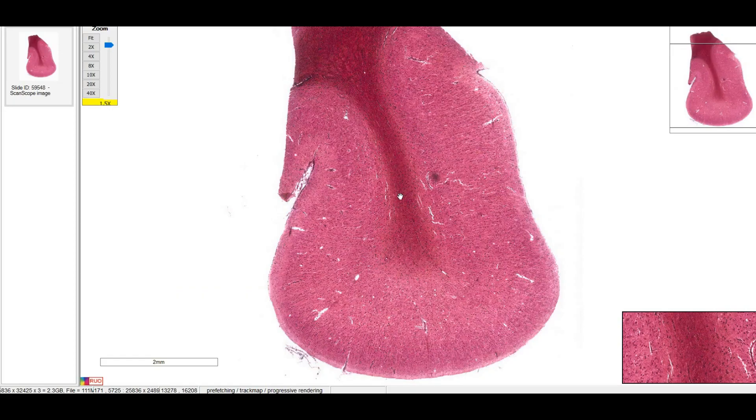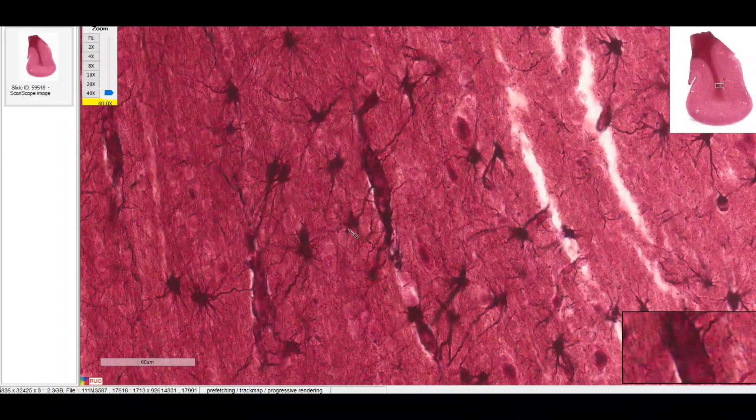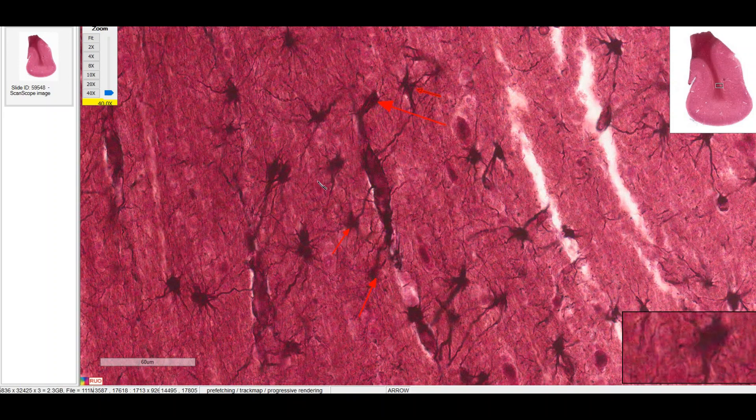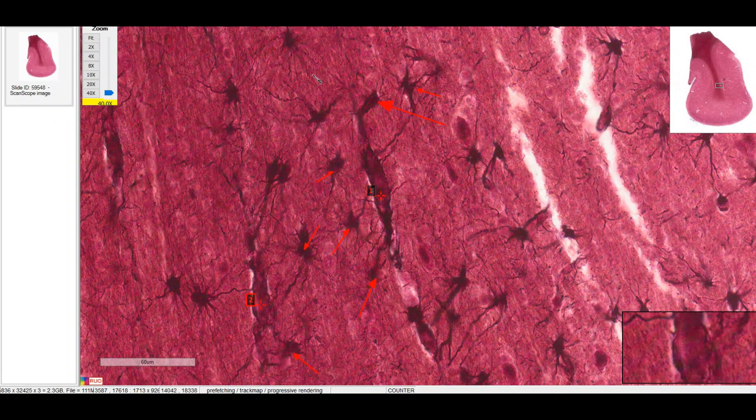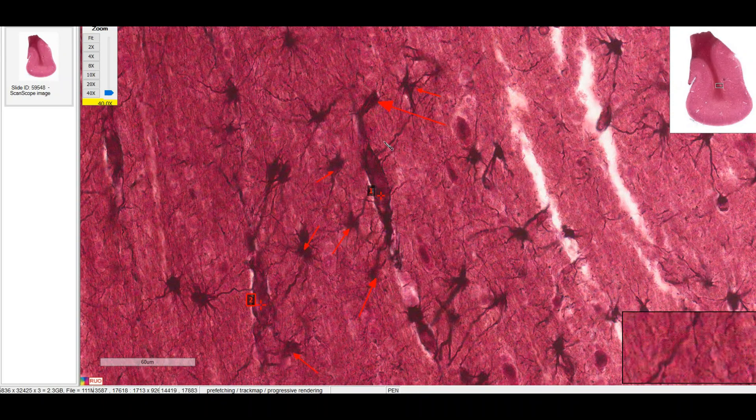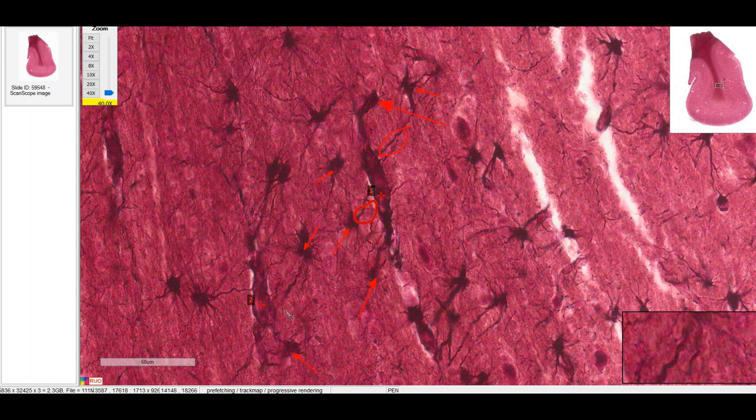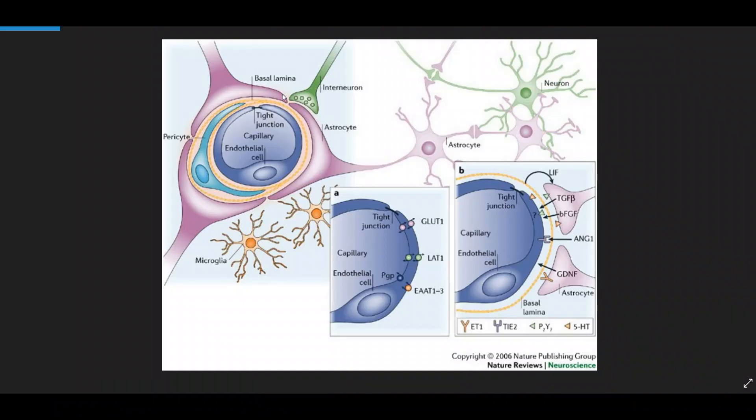Let's zoom in on the white matter here. Here we can see lots of astrocytes because the stain is specifically staining for astrocytes. We've got these two blood vessels here. And you can see all these foot processes extending towards the blood vessel to become part of the blood-brain barrier. This coating of blood vessels by the astrocytes and processes, it's called the perivascular glialimitans.